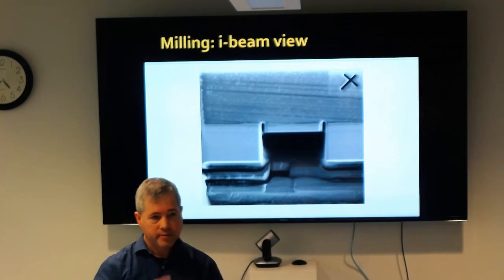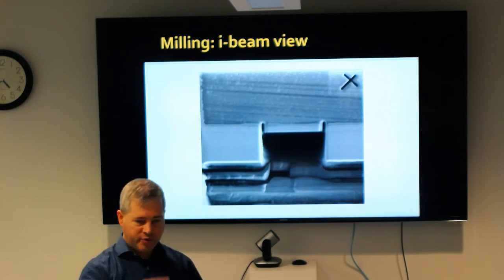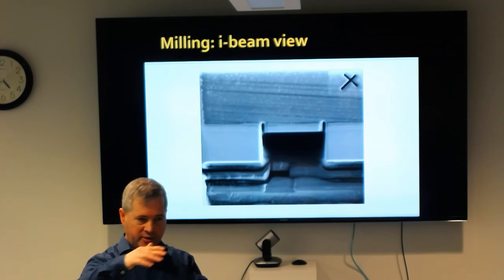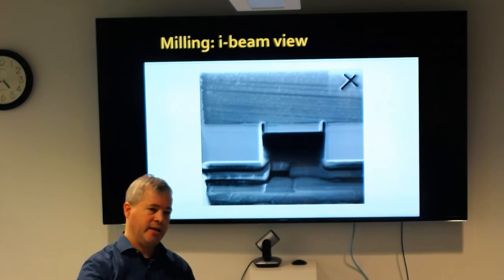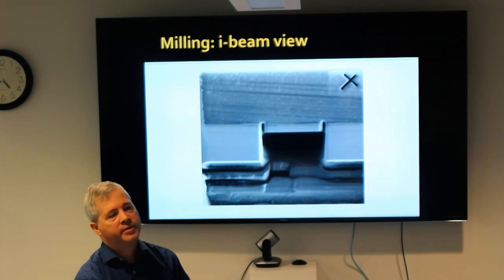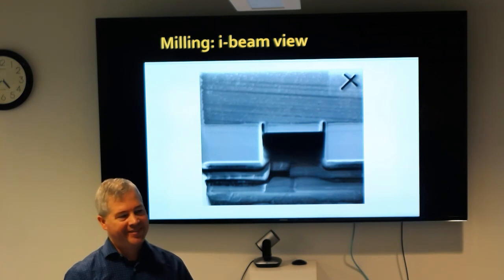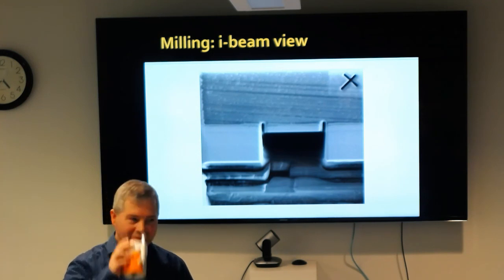Bill, for the cryo-FIB samples, how do you deal with heat damage? Or is that something you just have to slow the pace of milling down? Yeah, when you're doing the bulk mill ahead of it, you can mill at a higher current, but when you get closer and it's getting thinner and thinner, you have to lower the current, and it takes longer and longer. But fortunately, ice is so light it doesn't take too much to mill through. What's your smallest current? Are you using 20 picoamps, Alex, by the end? I think around 20 picoamps is the smallest. Yeah, around 20. You're right. I just wasn't confident with the units because you kind of ignore them at some point.